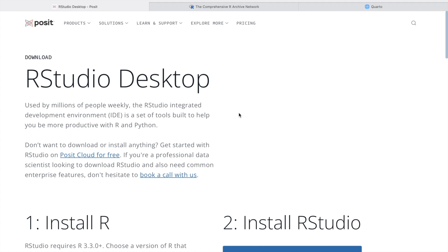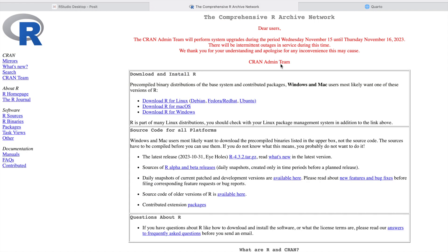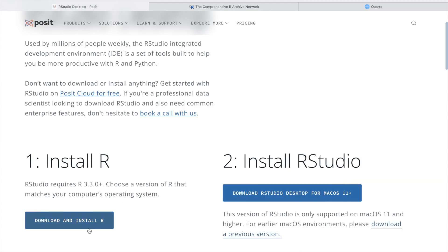The first thing you want to do is visit the website where you can download R and RStudio. Click the link and it will redirect you where you can download R for your specific operating system — Linux, macOS, or Windows. I am using macOS, and I have already installed R and RStudio. After installing R, go ahead and install RStudio, which contains the latest tools and packages.